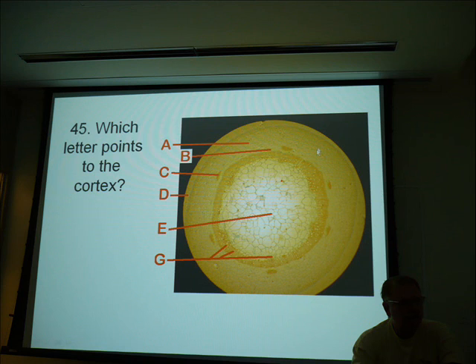Cortex and all this stuff out here. I didn't say it, but the endodermis is just outside this. The endodermis separates the cortex from what's inside the cortex. But I couldn't see it real good. Can y'all see the cells right there? Like a little line of cells. And it comes around. That would be it, but I figured they can't see that stuff.